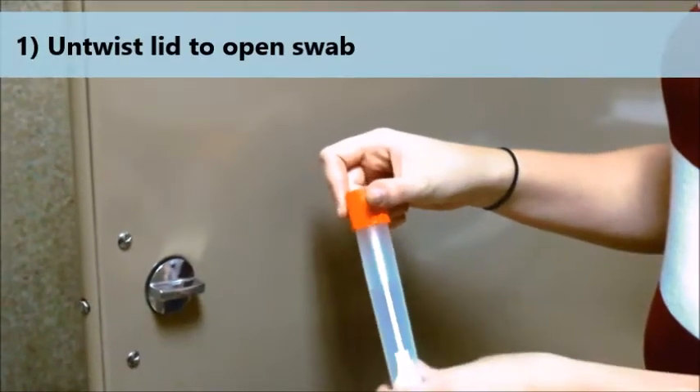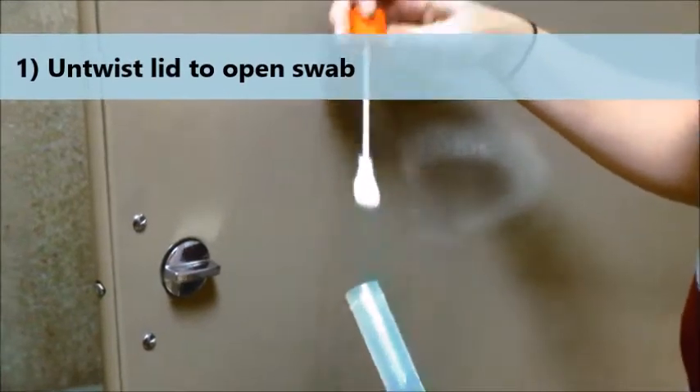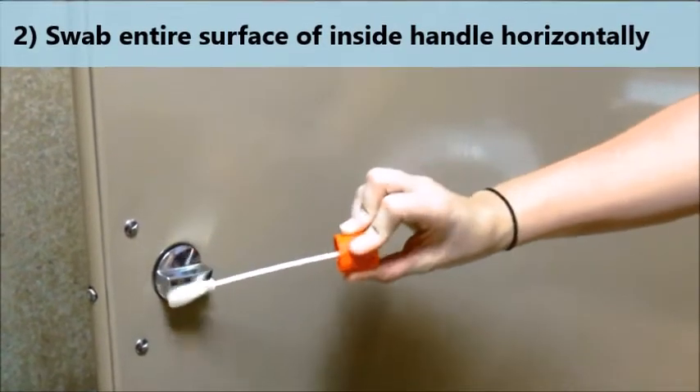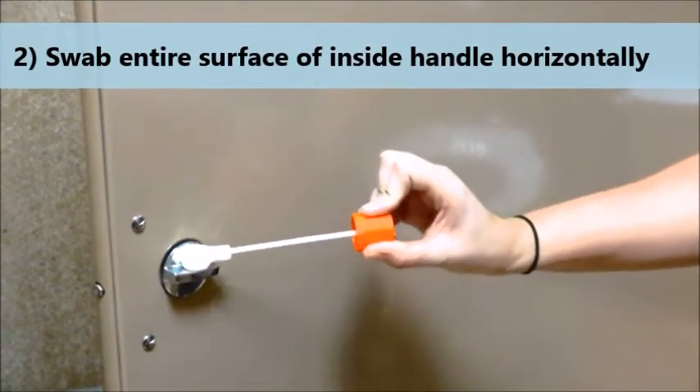First, untwist the lid to open the swab. Swab the entire surface of the inside door handle in a horizontal direction.